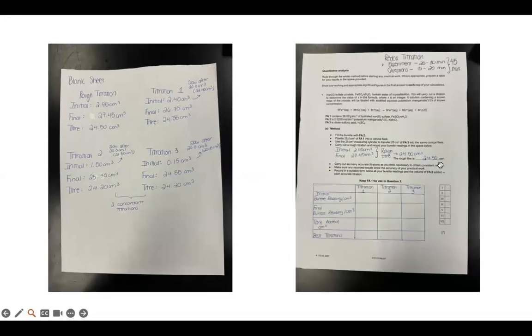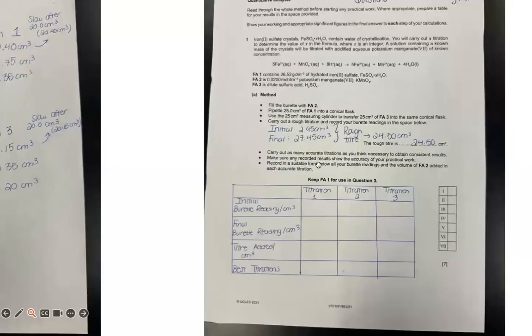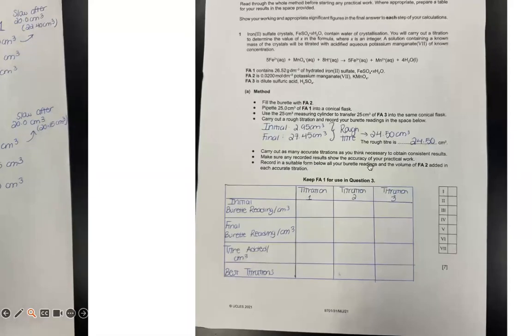As you can see here, it says, make any recorded results, show the accuracy of your practical work, and then it says record in a suitable form below all your burette readings and the volume of FA2 added in each accurate titration. So we're going to ignore the rough titration because it only says each accurate titration. Whenever you have titrations, this will always be your table. So you should try and memorize this, practice creating it very quickly so you can just do it on the test when you have the titration.